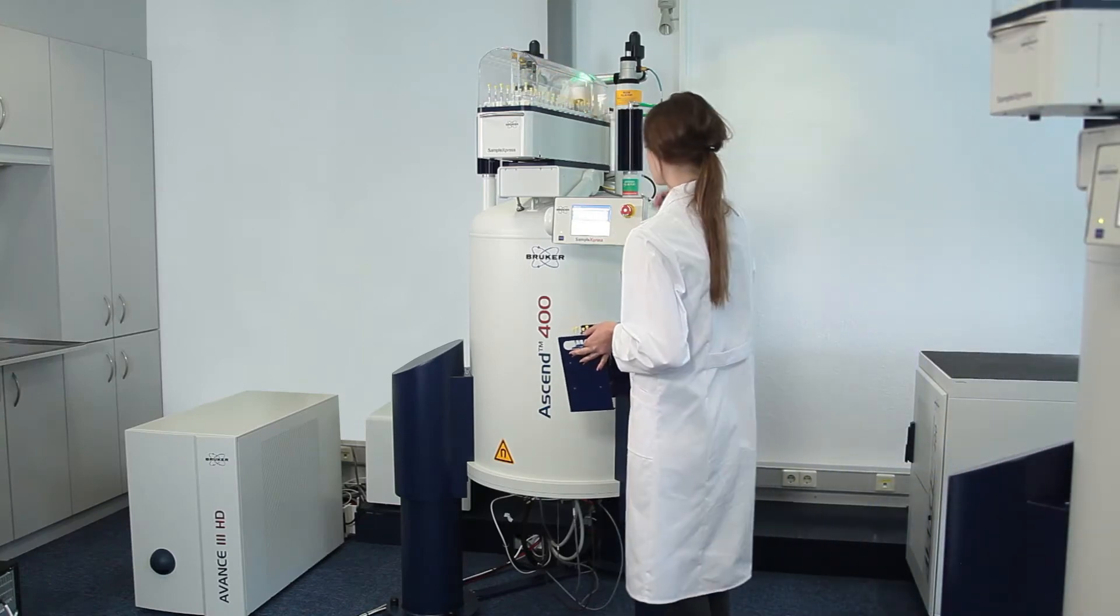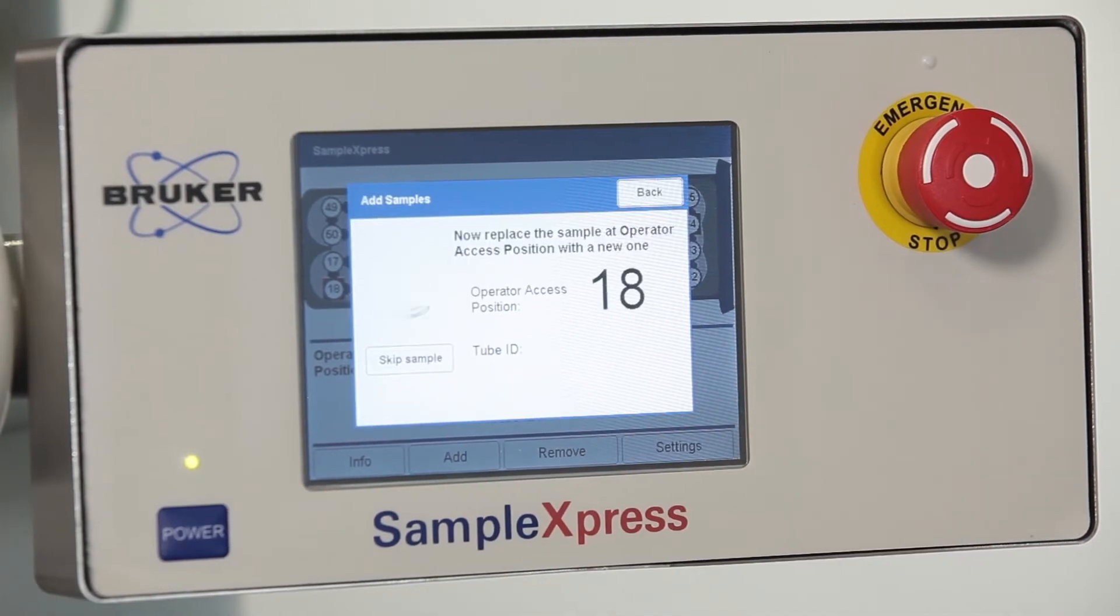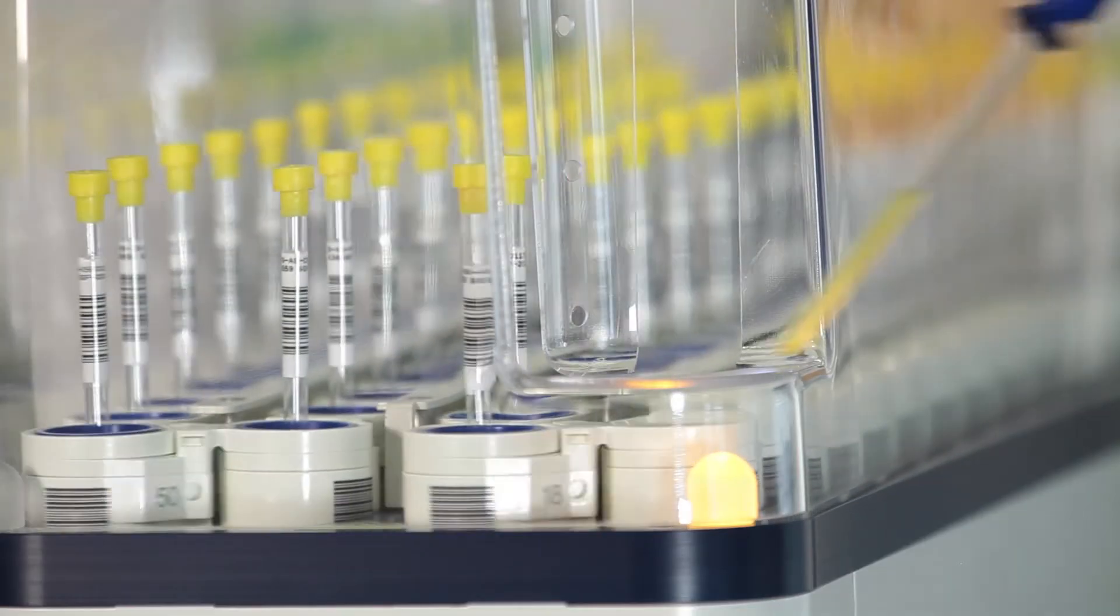Transferring samples into the auto-sampler is straightforward as the next empty holder is automatically moved to the insert position.